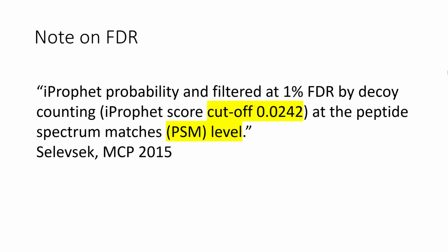So basically, there's one paper. The first paper I showed you is like, hey, we do DDA on the same sample. We don't even fractionate, and then we run it again, and you saw the impact of that. There was a really low false discovery rate. I can find the same things in DIA that I find in DDA. So if I just generate a library on my sample, I can go back and interrogate my sample, and I can get better quantitative results. That was a path-breaking paper.